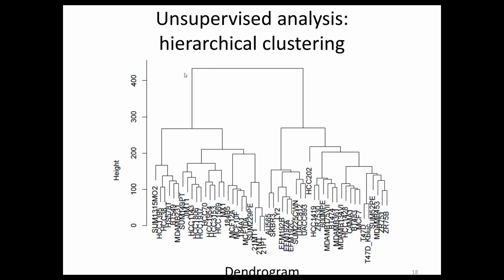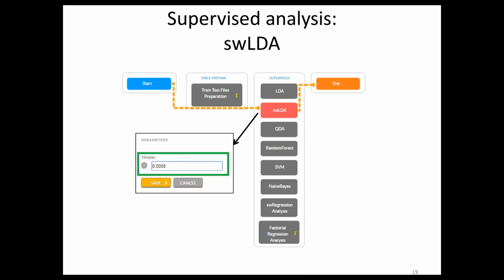And from this dendrogram, we see that we can speak about 4 clusters. For example, this is the first cluster. First group and cluster are synonymous. This is the first, second, third, and the 4th one. The next ones are not meaningful because they are really similar to each other, and there is no need to separate them into different clusters, different groups. And now about supervised analysis.